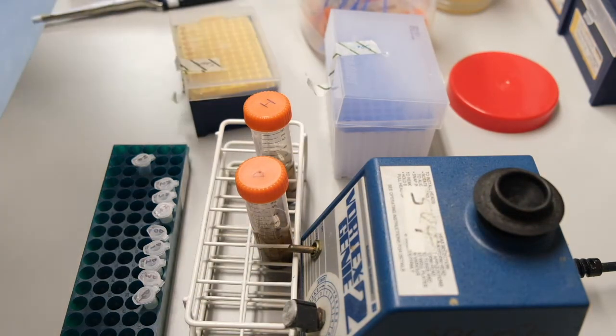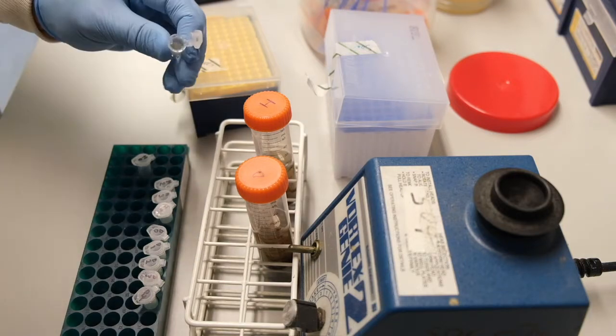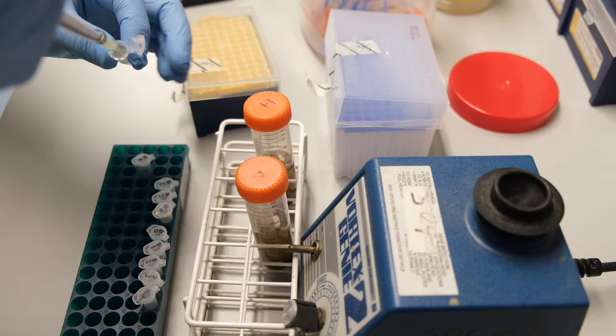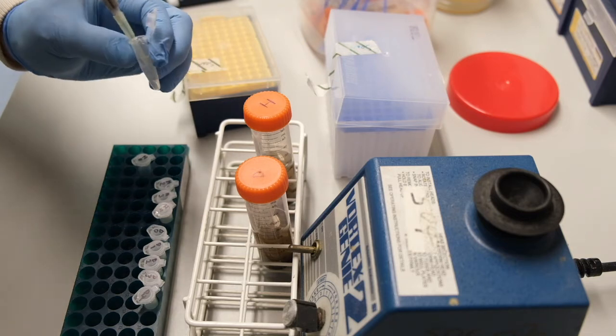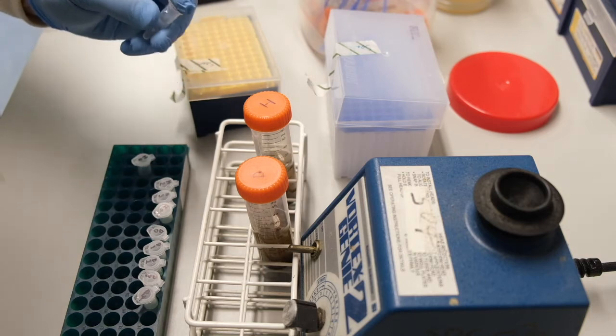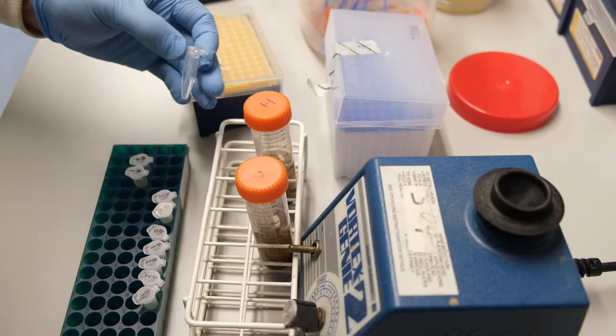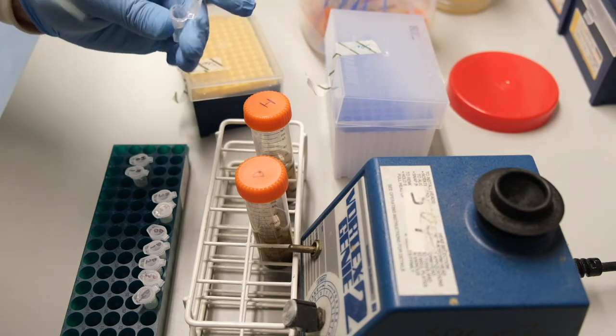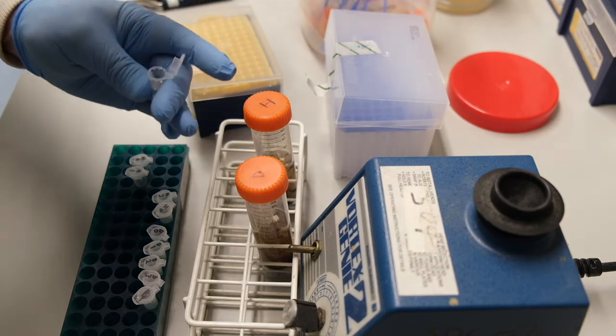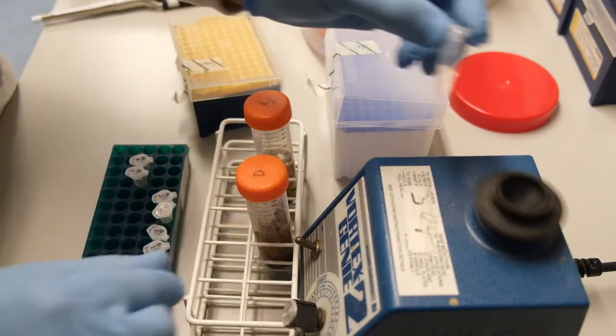We can now add 100 microliters of this 10 to the minus 1 dilution to 900 microliters of 10 to the minus 2 dilution. Again, we vortex to mix thoroughly.